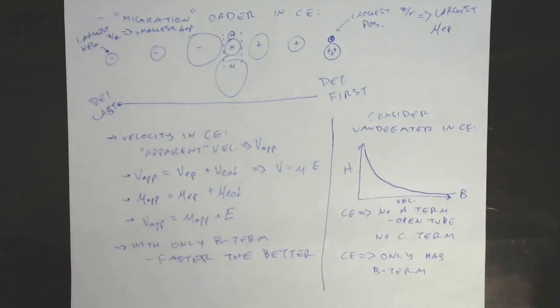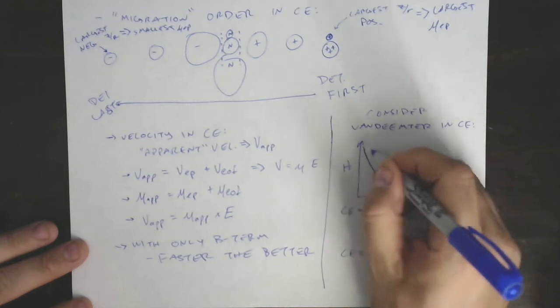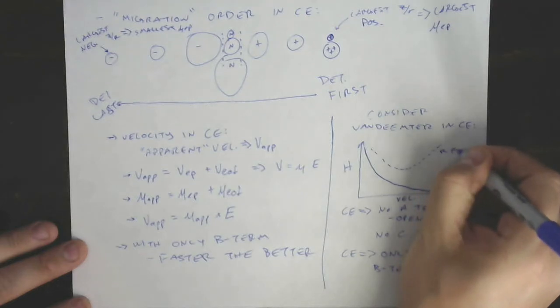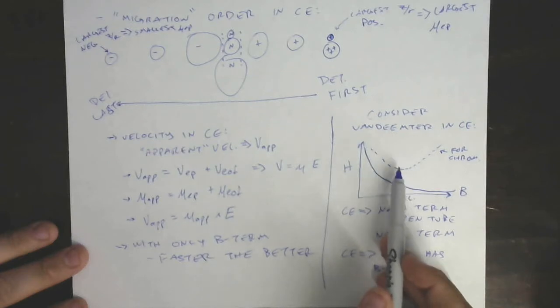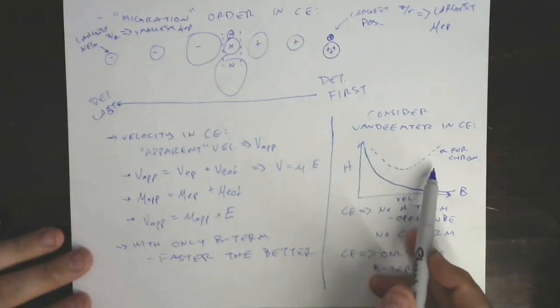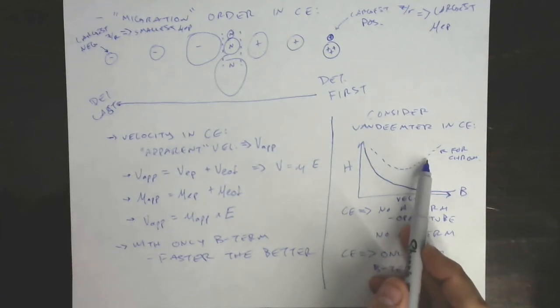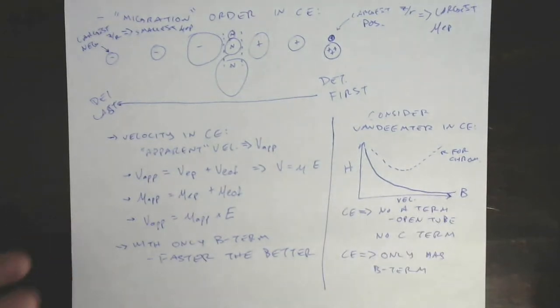And guess what? It's like the win-win situation, right? When we talked about classic Van Deemter, we said, a classic Van Deemter curve for some kind of chromatography method has some minima, right? So this is for chromatography. We said you never work on this side because you're getting worse peak efficiency and you're taking longer to do it. But you very often work on this side because although your efficiency goes away, at least you're getting your analysis done faster. Well, here's the beauty of CE. You go faster and it gets better, right? CE is like the win-win. It's one of the reasons why I love it so much.